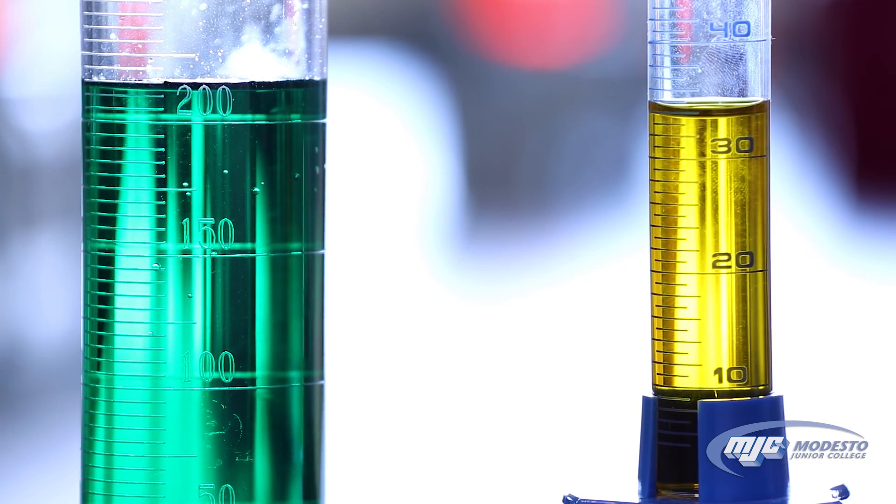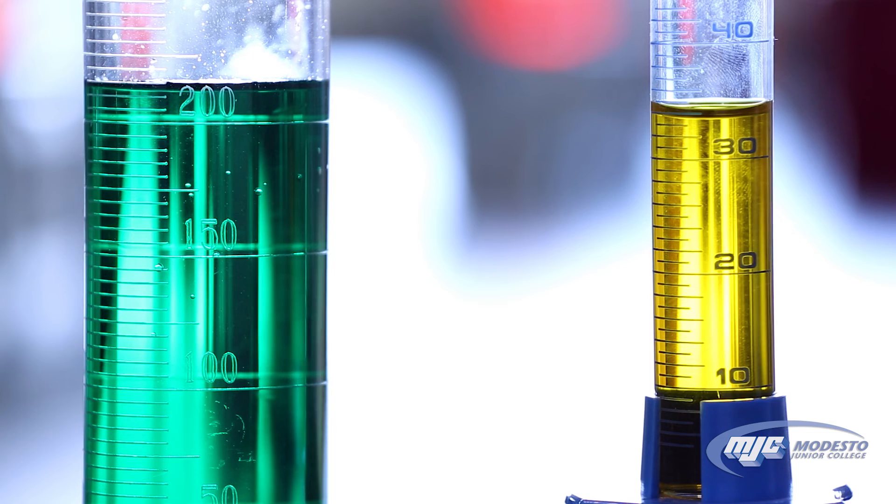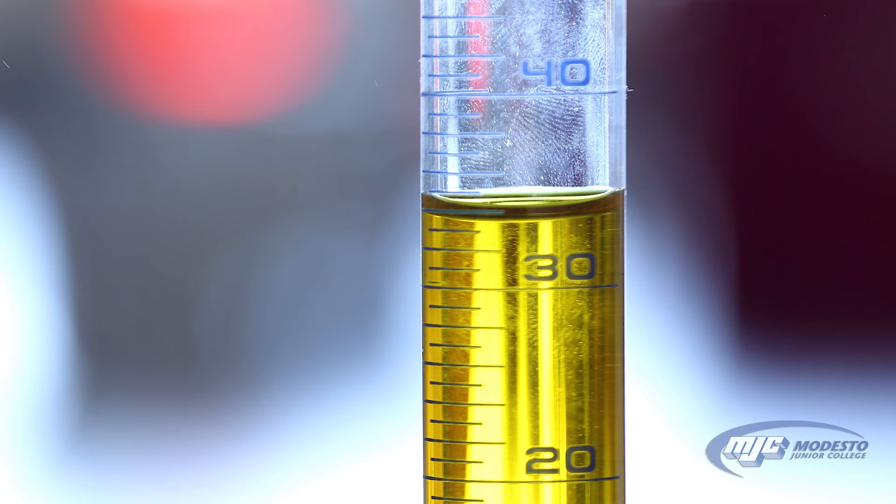When we read this smaller graduated cylinder, remember the closest marks are one milliliter apart, so we record to the tenth place. Zooming in: there's the 30, and each mark is one milliliter, so it's 31, 32, 33 — and the bottom of that curve is just under the 34 mark, so we might call this 33.9 or 33.8 milliliters. That last digit is estimated, and it's your call.